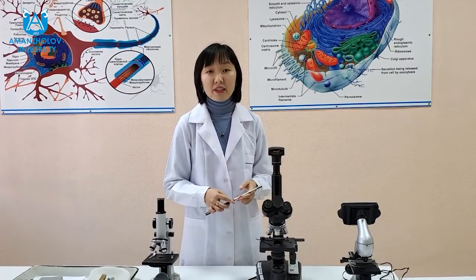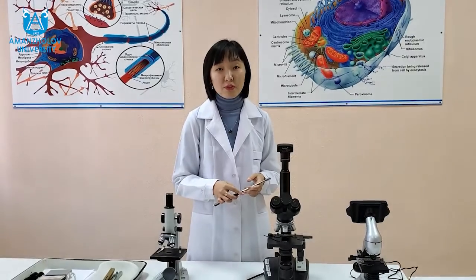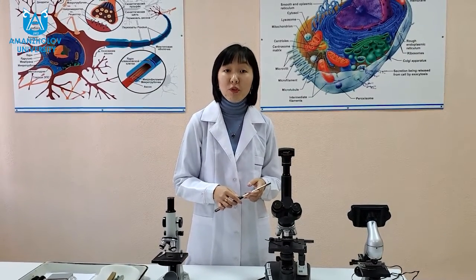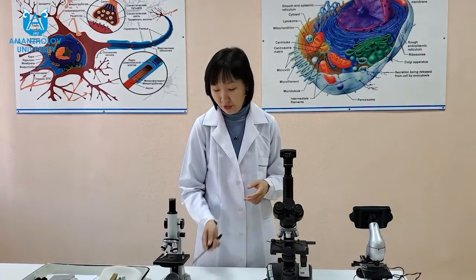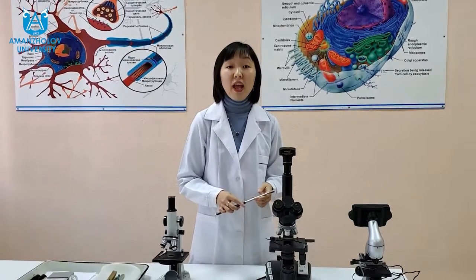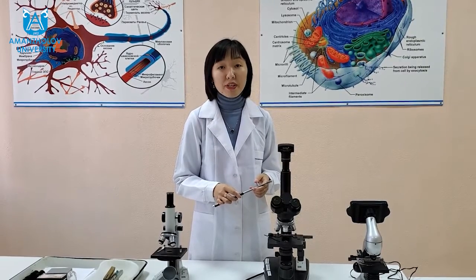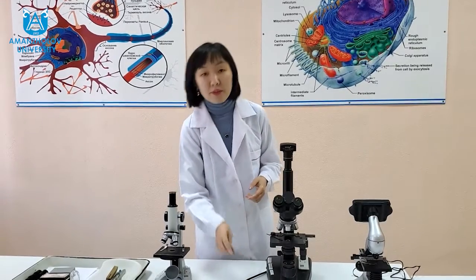And last, the light lens system. The illumination system is an important part of the microscope design and is a system of lenses, diaphragms and mirrors. The latter are used as needed, providing uniform illumination of the object. The illumination system of a transmitted light microscope consists of two parts, a collector and a condenser.